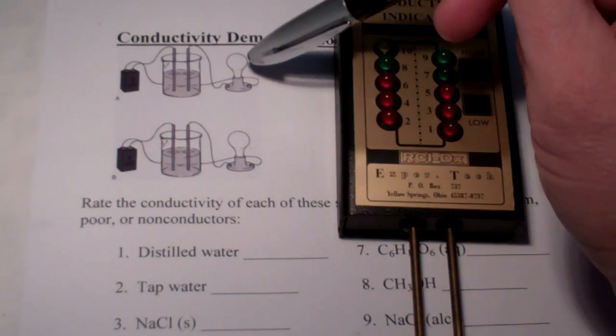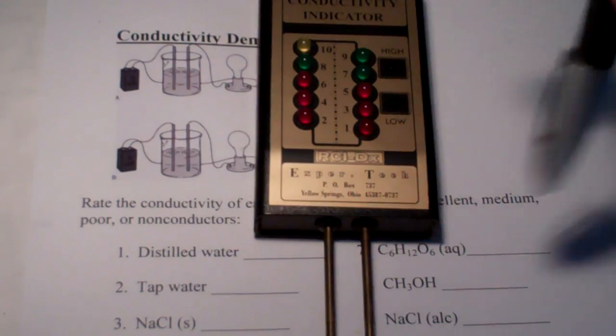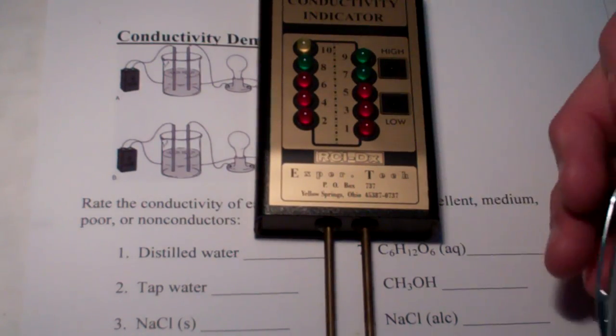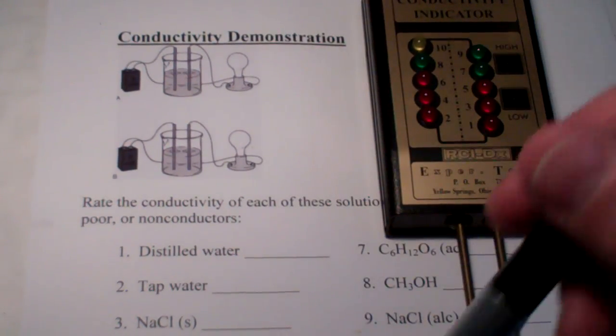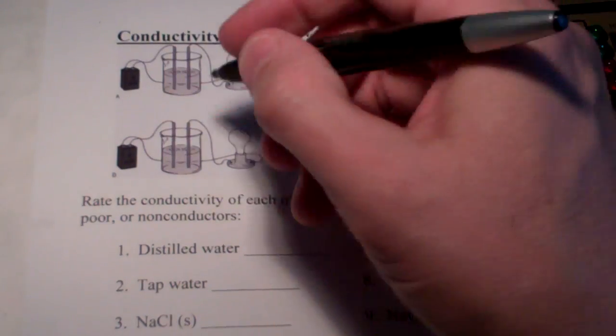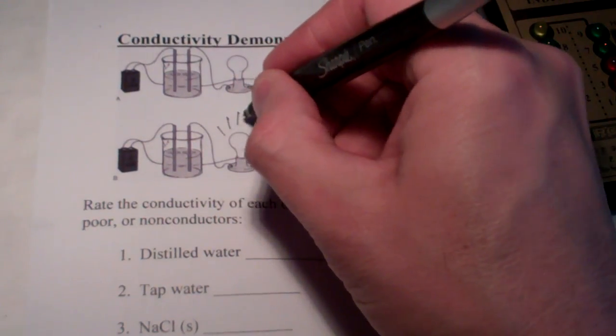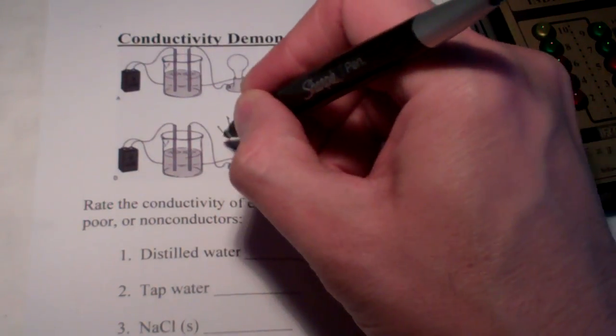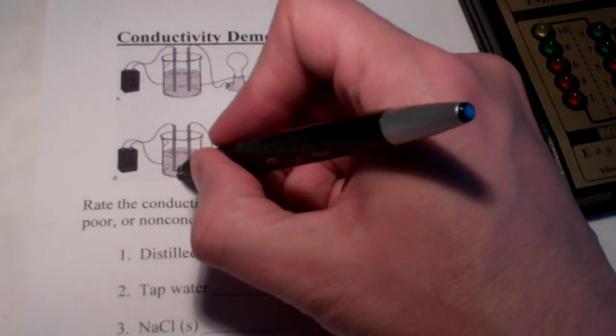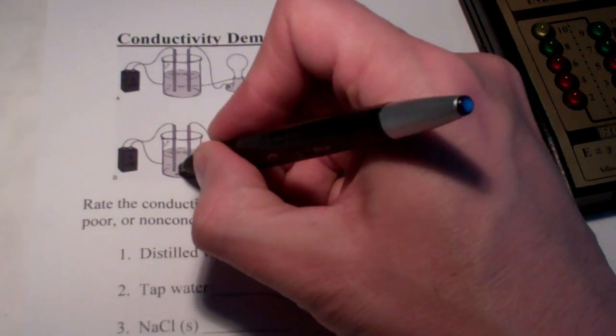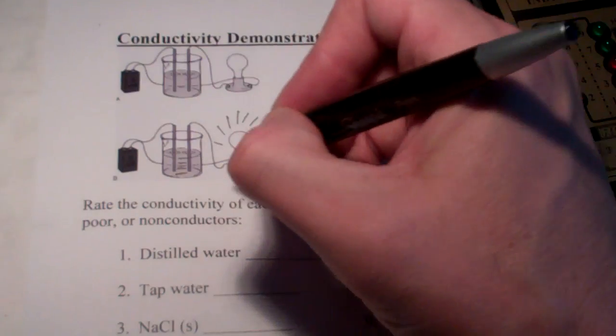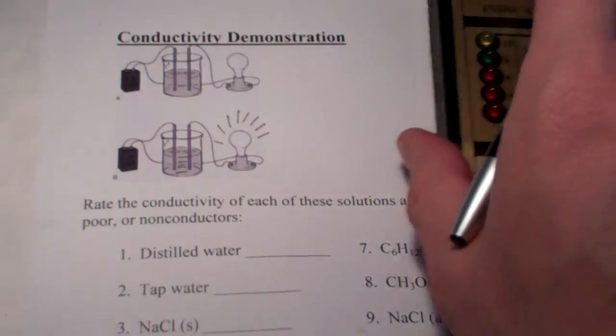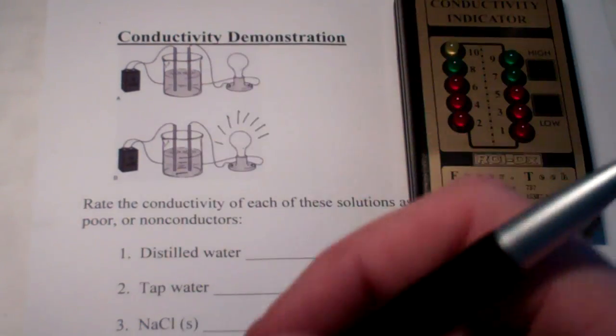Now, there's something in some of these solutions that allows the current to be transferred from one electrode to the other electrode. We can identify that by the light bulb lighting up, or in this case, our indicators lighting up to tell us how conductive it is. So, if the light bulb is on, there's something that is completing the circuit between those electrodes. If it's off, of course, nothing can complete that circuit.